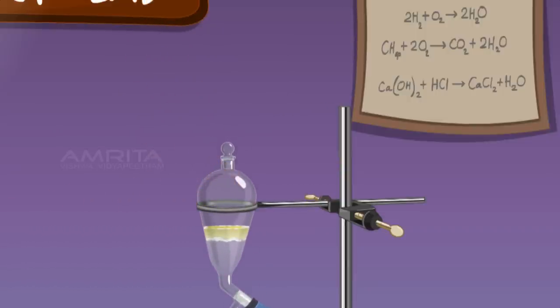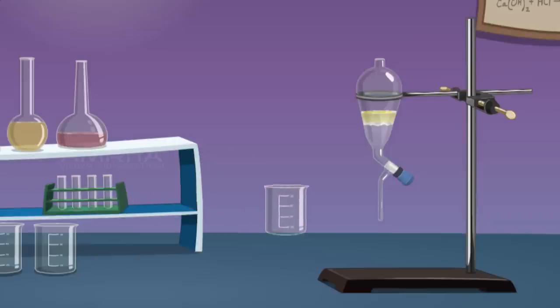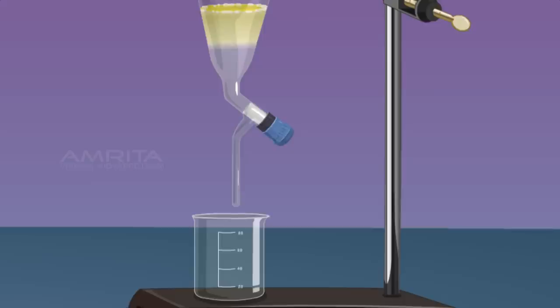Oil forms the top layer and water forms the bottom layer. Take a beaker and place it below the separating funnel. Open the stopcock of the separating funnel and pour out the lower layer of water carefully into the beaker. Close the stopcock as the oil reaches the stopcock.